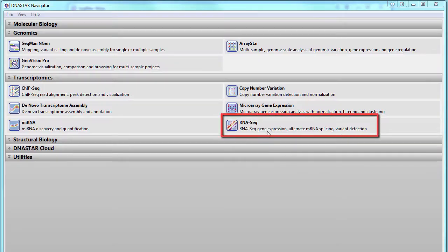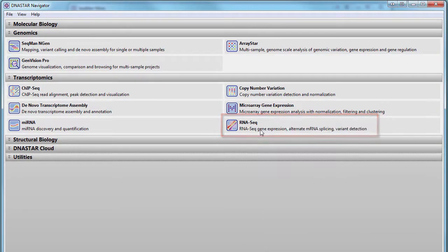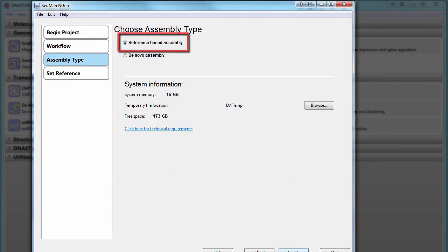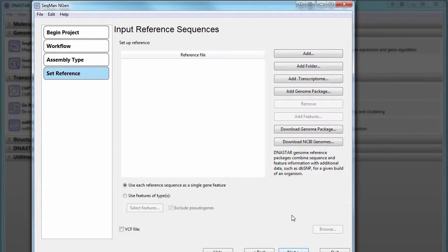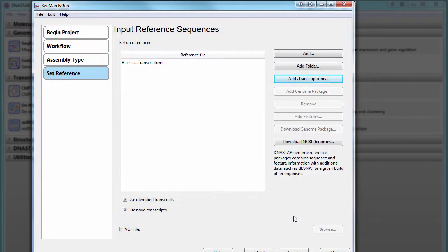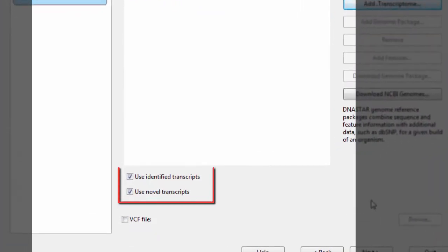You can then perform RNA-seq analysis under differing conditions by setting up a new transcriptome assembly, this time selecting reference-based and then loading your assembly results as a reference set. You can either choose the FASTA file of selected transcripts or load the entire .transcriptome package. You can then choose to include identified transcripts, novel transcripts, or both as a reference set for RNA-seq analysis.